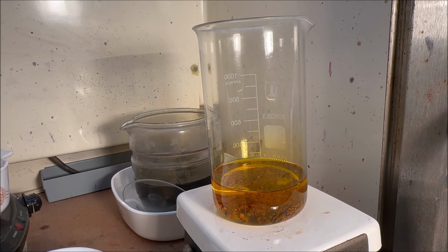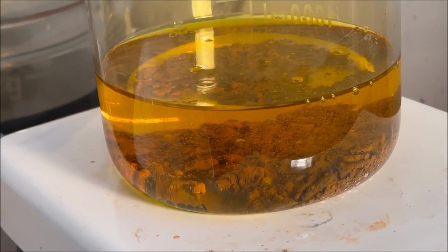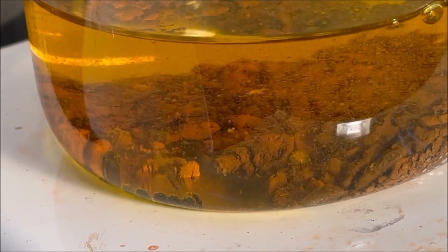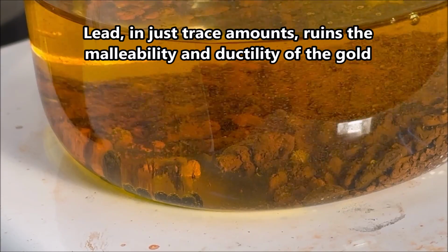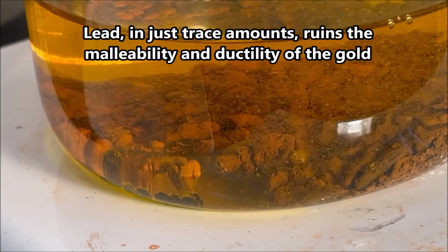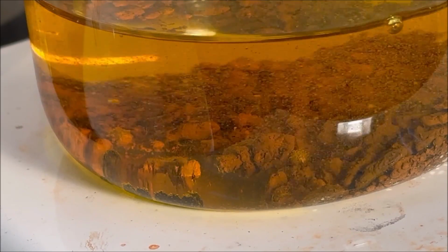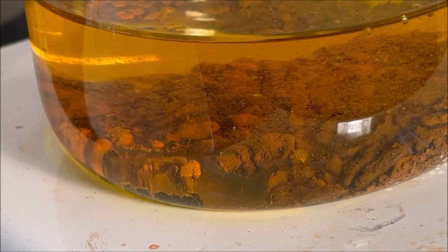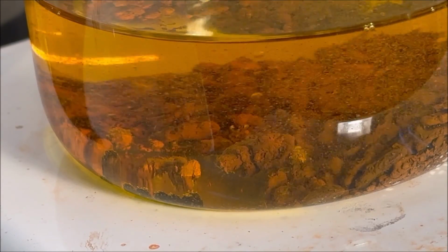And now what we'll do is we'll start adding nitric acid and see if we can get this gold to dissolve. And then once we get it dissolved, I want to see if that lead shot is going to dissolve with the gold. Lead is terrible for gold. And so what we want to try to do here is dissolve that lead with the gold, and then see if we can detect it when we add sulfuric acid later on.